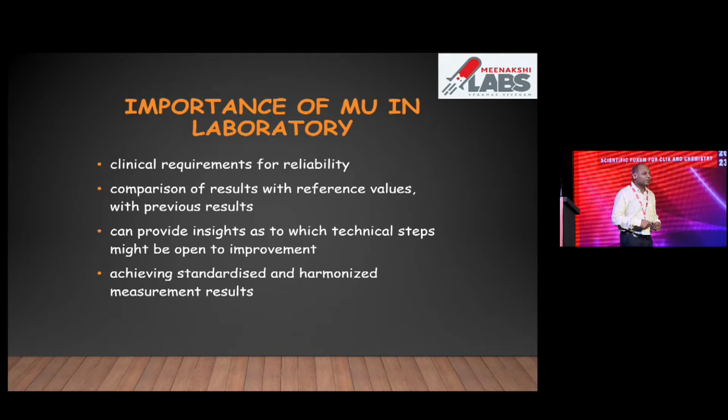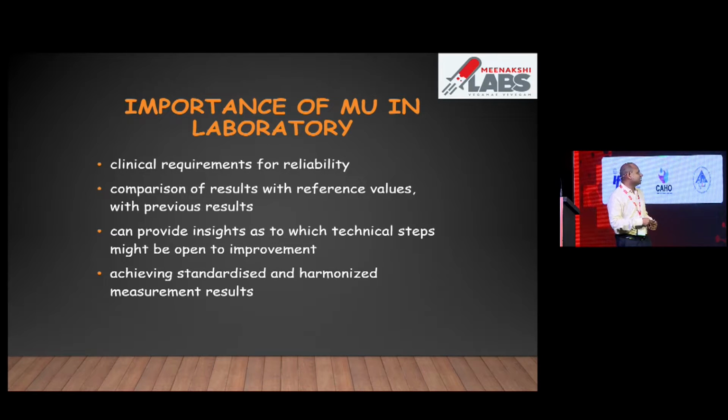So why is it important? Here I have mentioned some points: clinical requirements for reliability, and comparison of results with reference values. It can provide an insight as a technical step, and it can achieve standardized, harmonized measurement results. Considering its importance, I will give you one simple example.